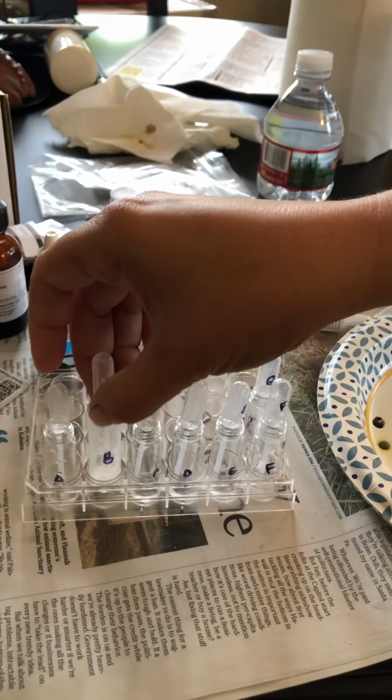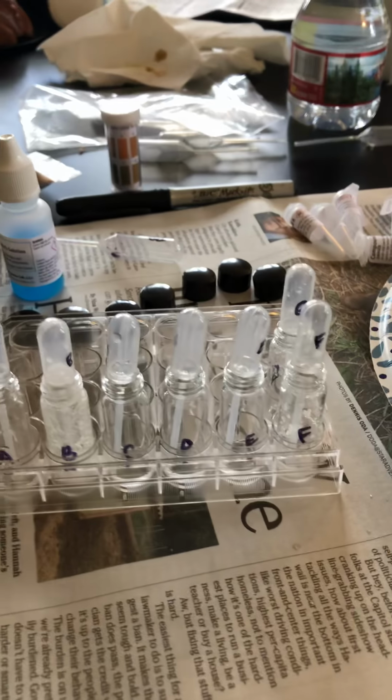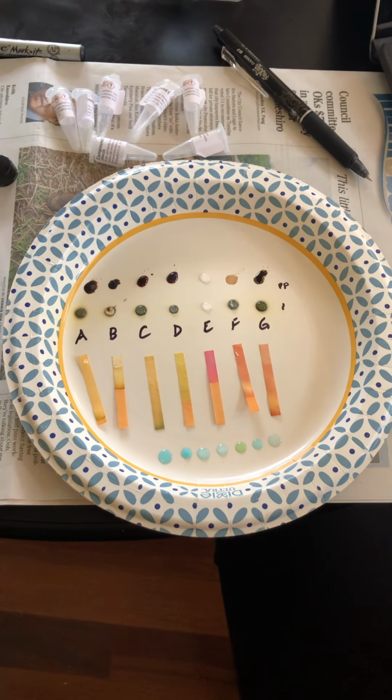Okay, so using all those different tests, I ended up making the different vials here. As you can see, some of them solubilized, some of them didn't solubilize so well, and then over here on the paper plate, my results. So we'll just kind of stay on the results for a while.